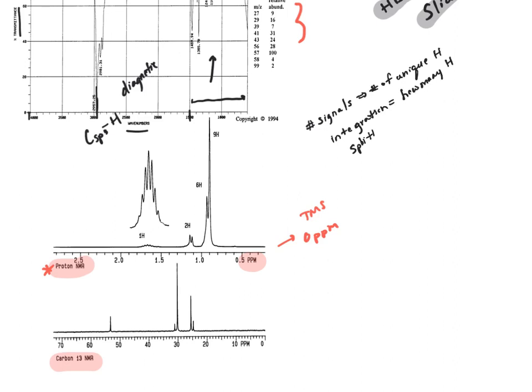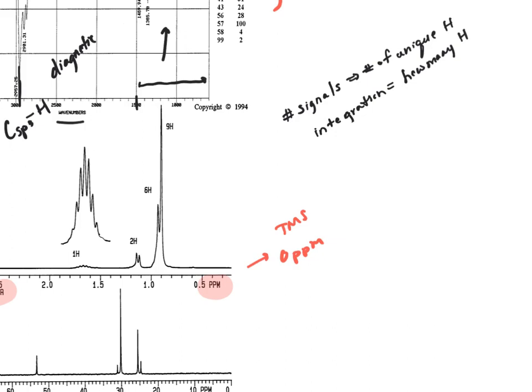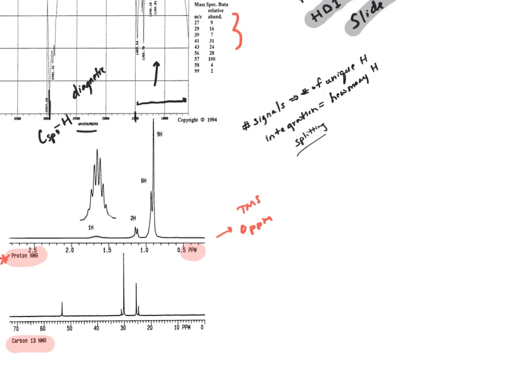So this is why I stress going through all of the Proton NMR lecture, or at least understanding splitting, right? Spin-spin coupling and why we get these various splitting patterns. Because this is actually going to be the thing that tells us the most about who's nearby each signal, right? So who is nearby.